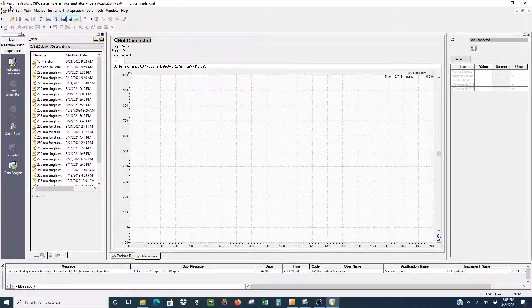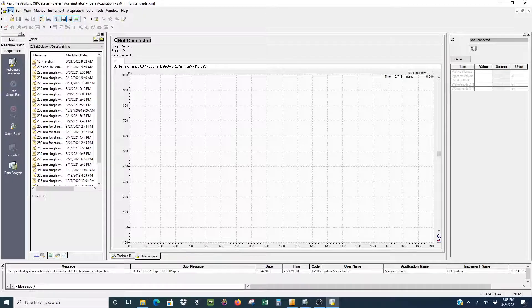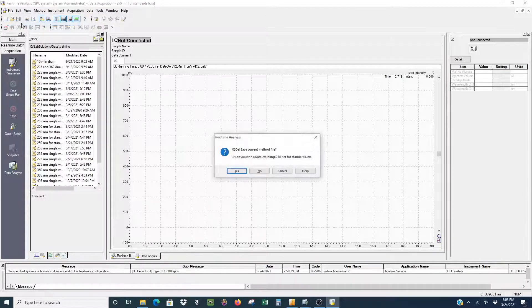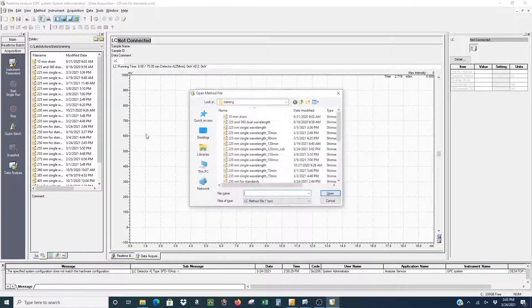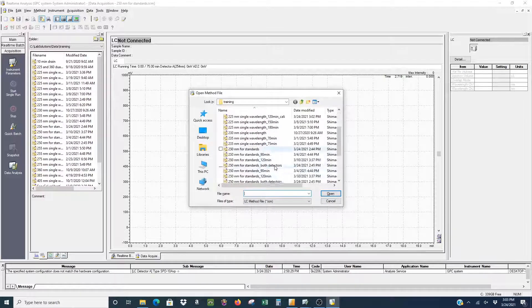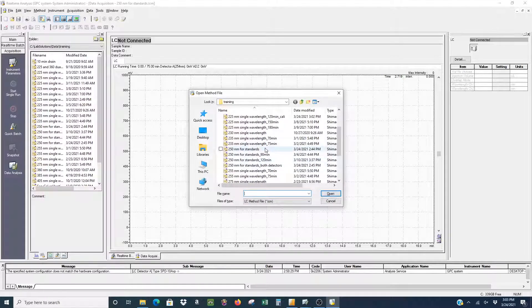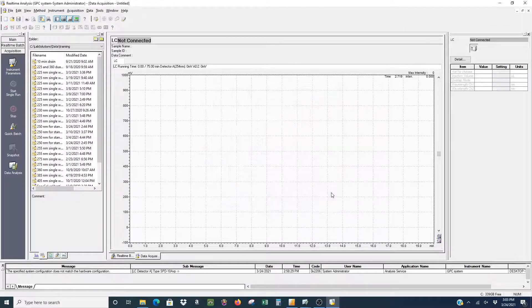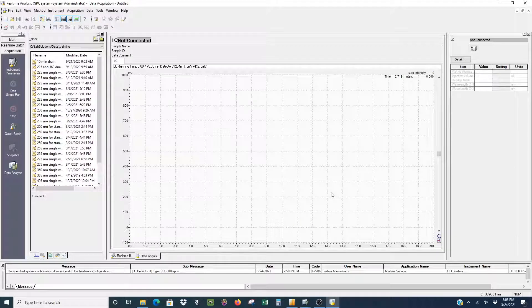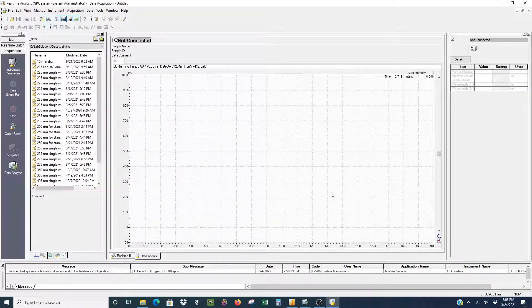From here, you would go to File and then open the method file so that we can select the detectors that we want to use. You can see we have a bunch of different files here that you can choose from. Just choose the one based on the wavelength of UV light that you want to detect.